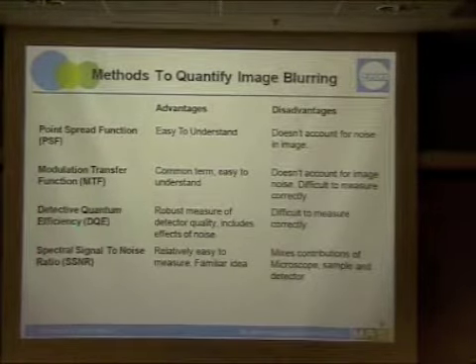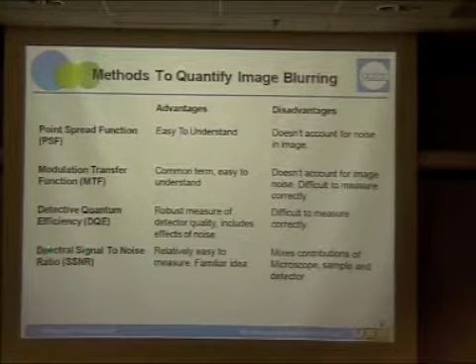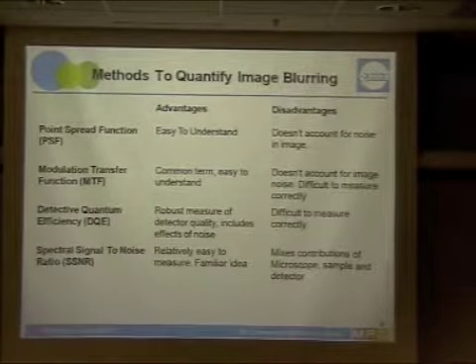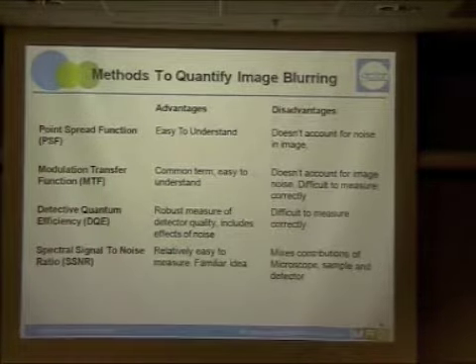That's what we use internally to evaluate our cameras. Now, what Wasl's lab used is the spectral signal-to-noise ratio, which is a familiar idea to the cryo-EM community.